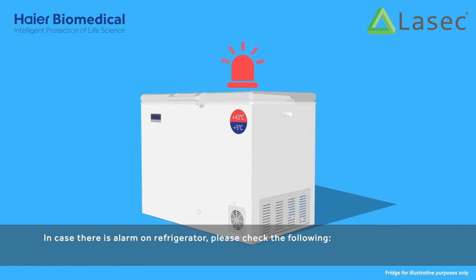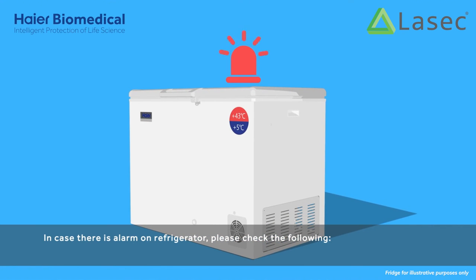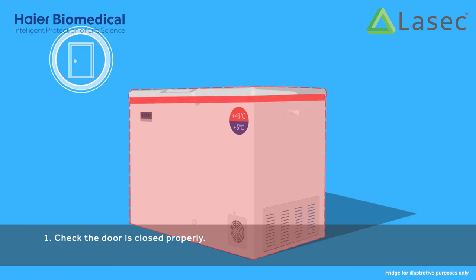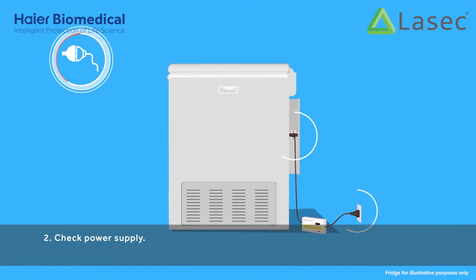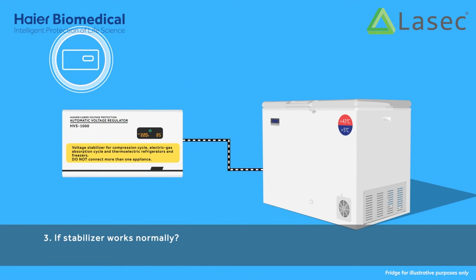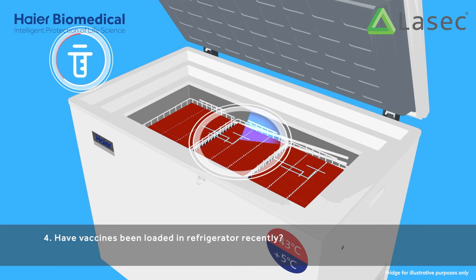In case there is an alarm on the refrigerator, please check the following: 1. Check the door is closed properly. 2. Check power supply. 3. Check if the stabilizer works normally. 4. Have vaccines been loaded in the refrigerator recently?